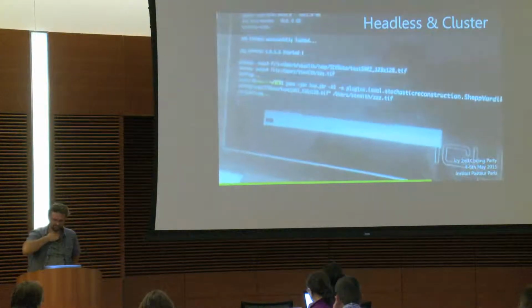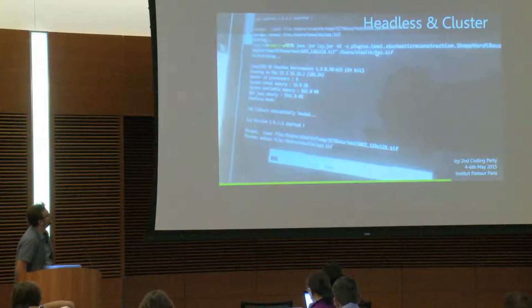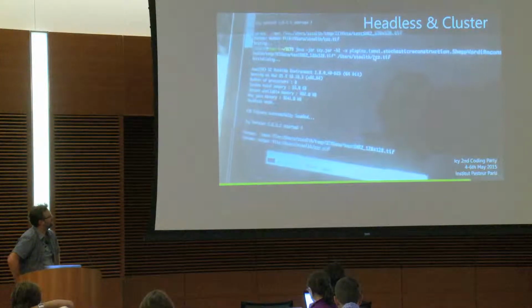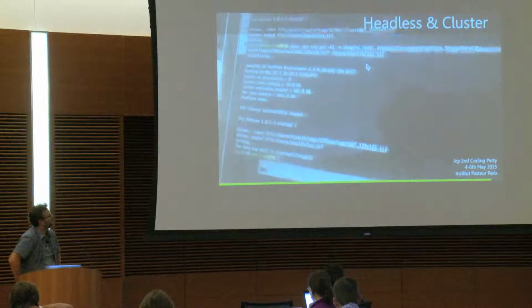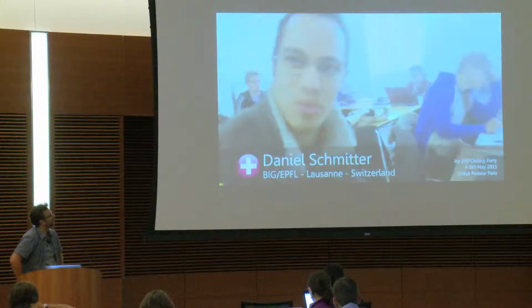So we can also run it headless, and then it takes the same input image and output image, and after some time it produces the result, which is saved to the hard drive. Yeah, so it's done. Thank you.